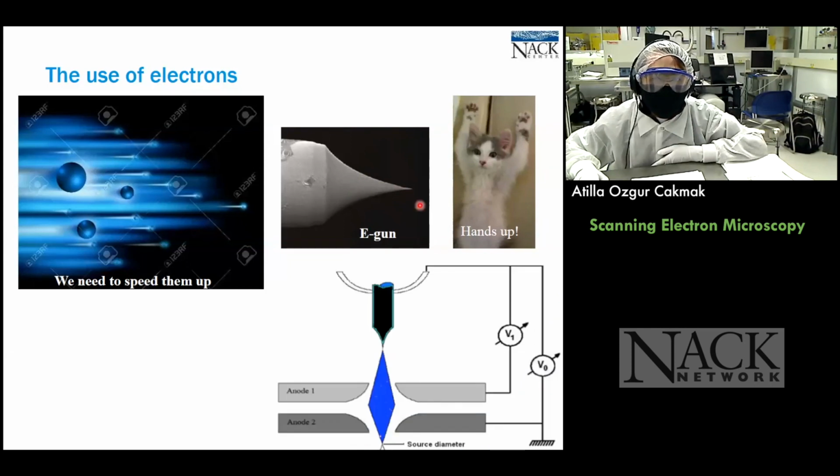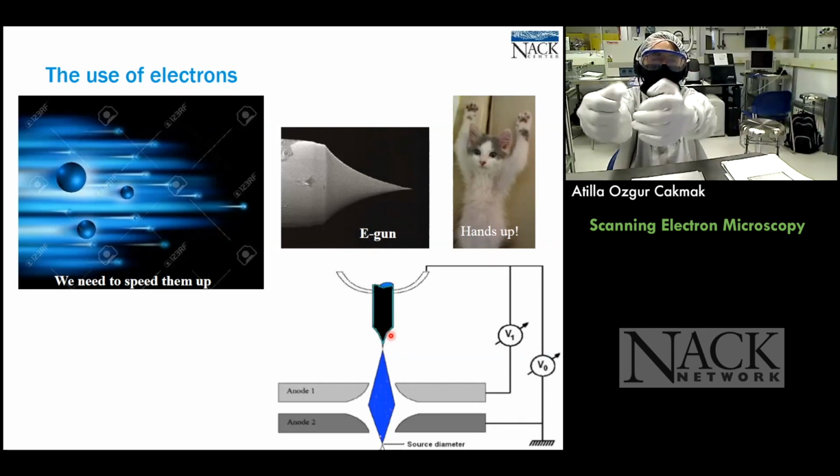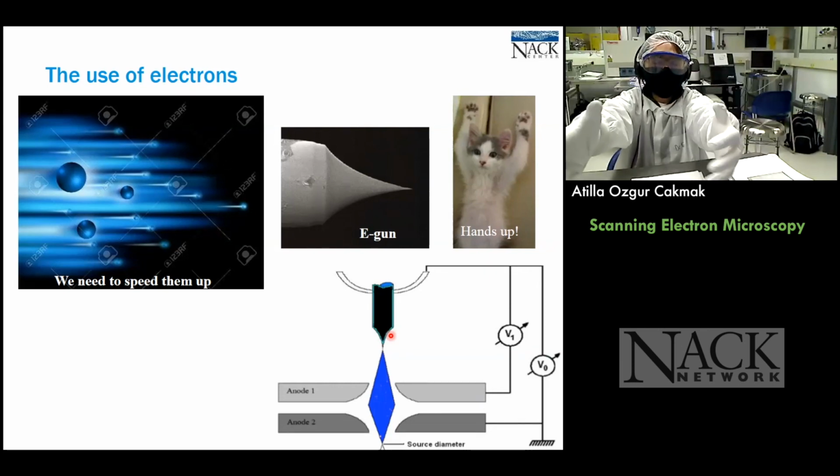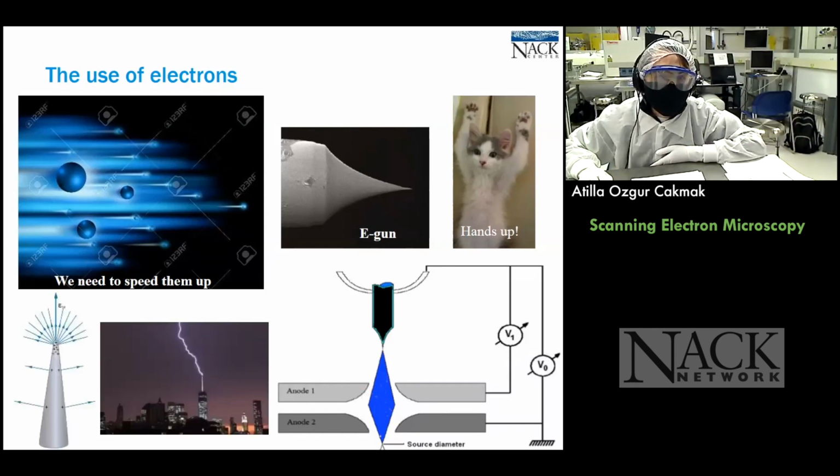All right, so in a more sophisticated way of saying it, this is our tip, the electron gun this time. Remember the tip that Wes was talking about. Now this is going to be our tip in this case. We're going to use these power supplies, okay, to extract electrons. We're going to release the electrons. We're going to speed up the electrons and let them start their journey to the sample. And we're going to shape these electrons as we move along too. So this works in this way.